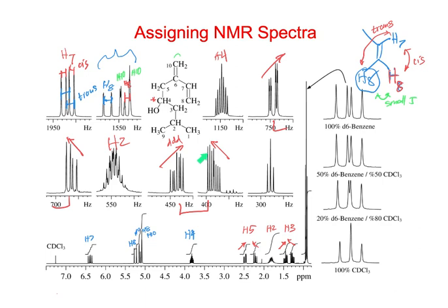But we have a doublet of doublets of doublets. Same here if we count the little small ones, but this one looks more like a doublet of doublets. I think there might be a tiny coupling inside here on these, but we can't really see it. Like this one, see those little couplings in there?